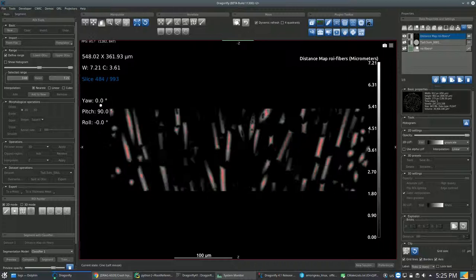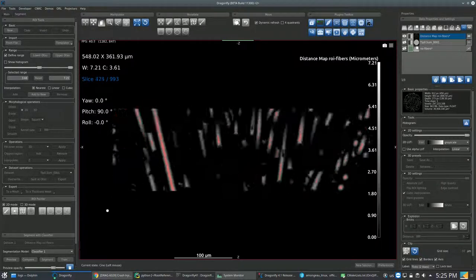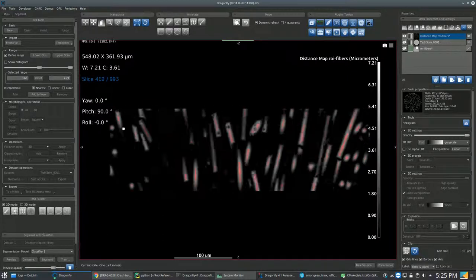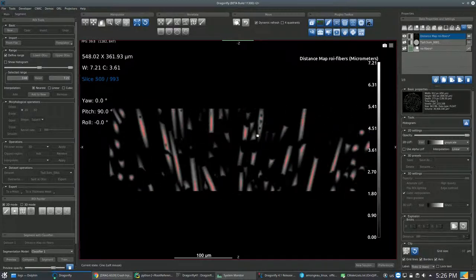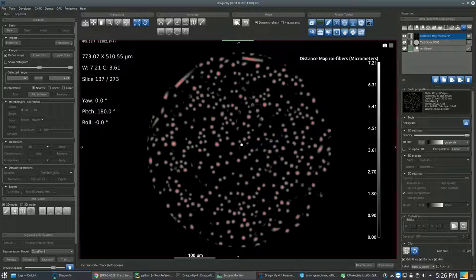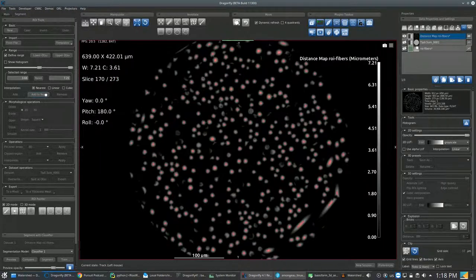To do this, you can zoom in the view to make sure that both conditions are met. You can also inspect different slices and axes in the image. When you find a good range, click on Add to New to create the new seed ROI.